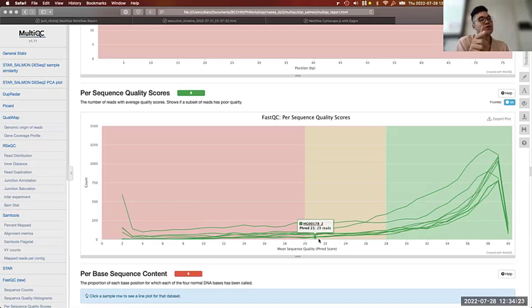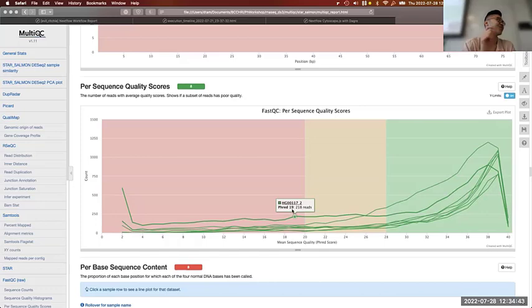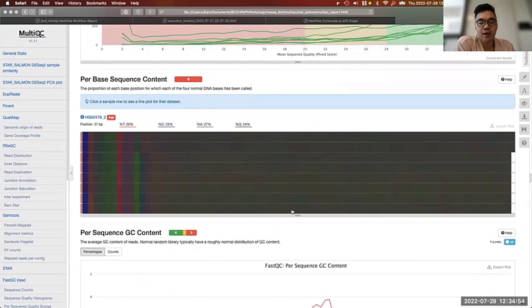So then originally I was getting a ton of QC failing, and it just wouldn't move through the pipeline because it thought your FASTQs were broken, because they should all be paired. So that's why there's that one flag, if people remember from the morning session, where I had to say the minimum number of high quality reads is 1 and then just run it. That needed to happen, but you don't need that if you're actually running. I think the default value is like 20,000, but there's not even 20,000 reads in these libraries.